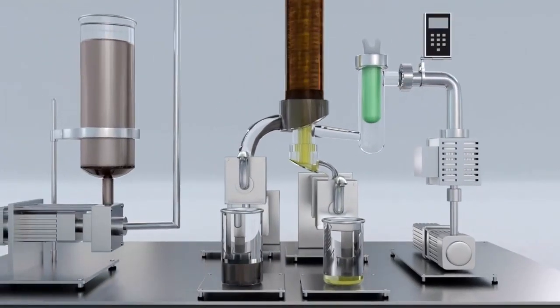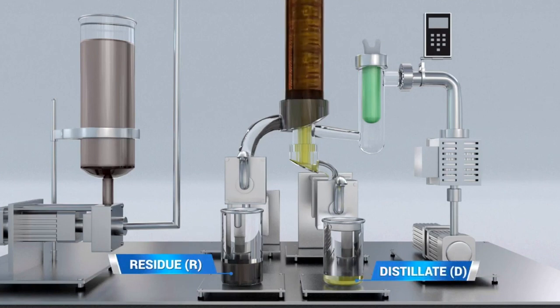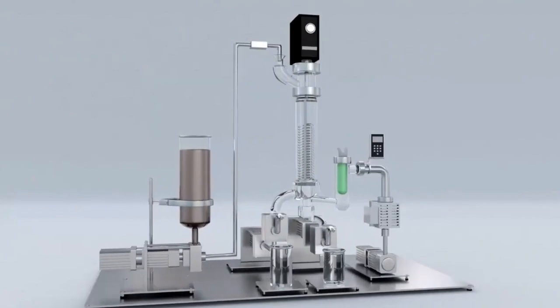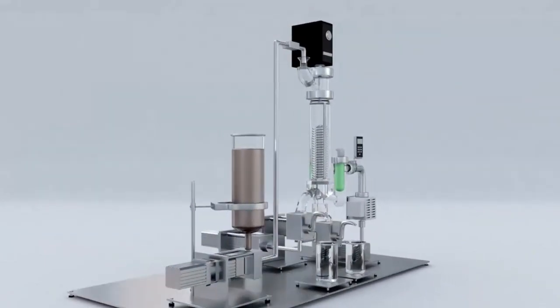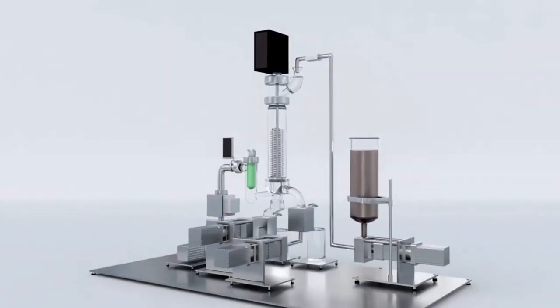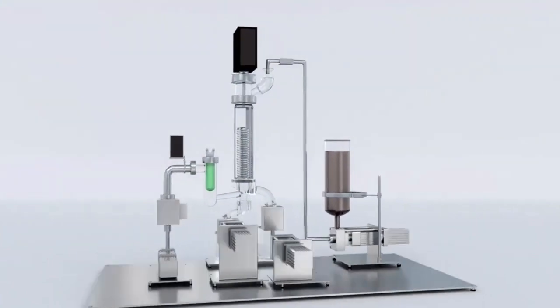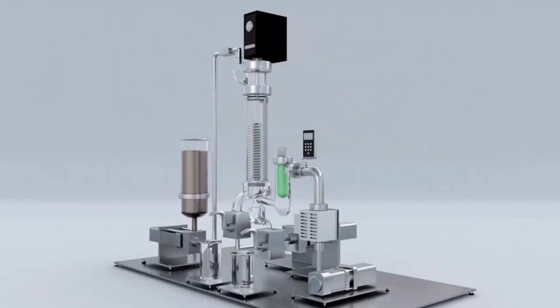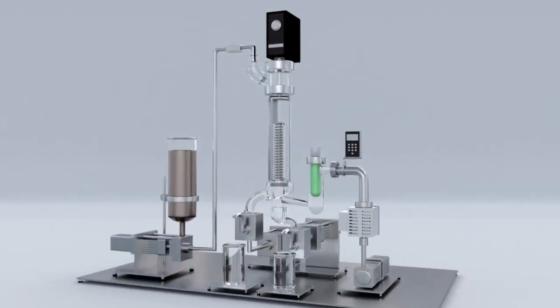All other non-evaporated fluids from the hemp oil will flow out of the bottom of the system continuously as two products: the residue and the distillate phase. The distillate phase is the final hemp essential oil product, while the residue contains byproducts and other impurities. A mechanical roughing pump and a diffusion pump operate the system as a vacuum. This means the system's pressure is so low that the boiling point temperature of the oil is reduced, making it easier to ensure that beneficial compounds aren't ruined or overheated out of the final product.